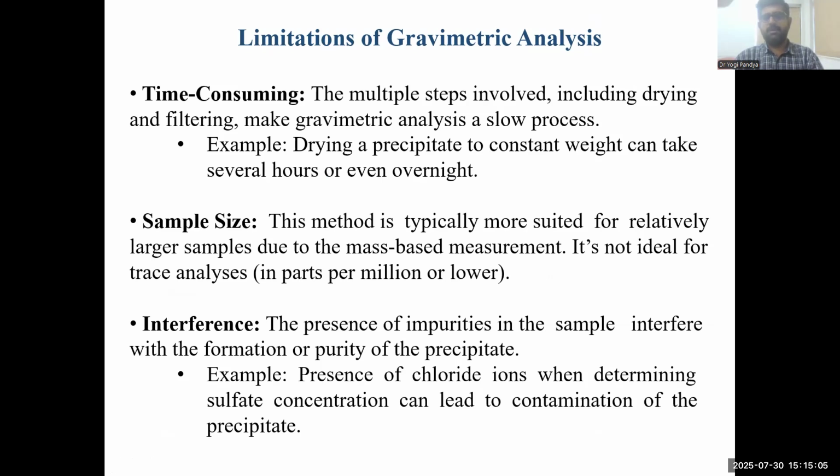Then what are the drawbacks, or you can say the limitations, of this gravimetric analysis? First of all, it is a time consuming method, right? Because we have to undergo so many multiple steps, right? Precipitation, filtering, washing, drying. So overall, it is a very slow process, right?